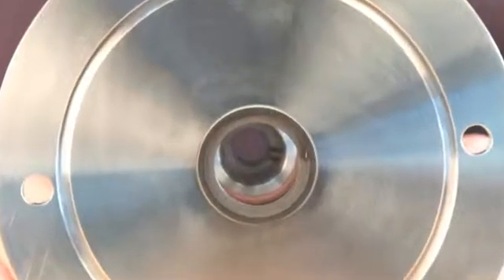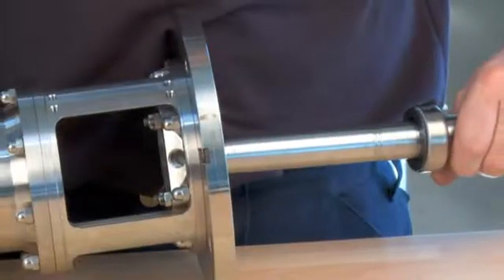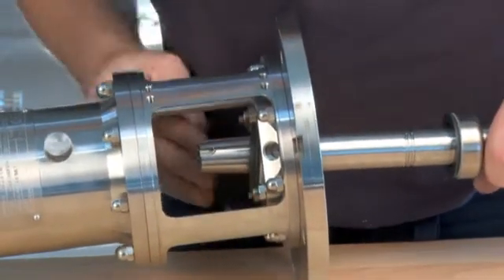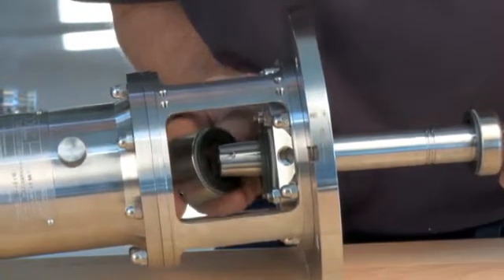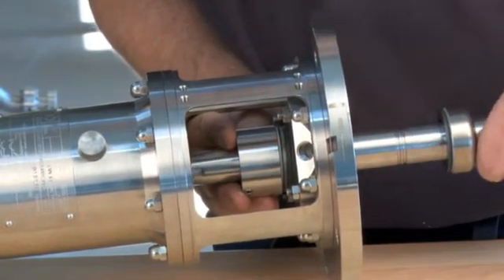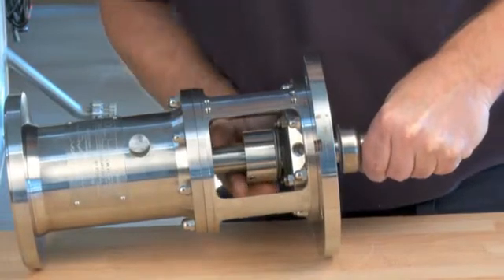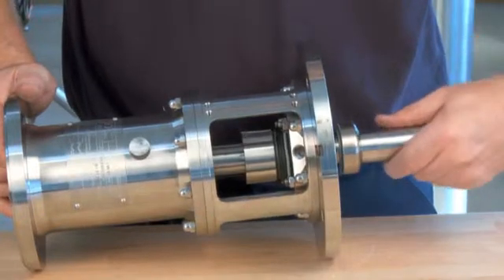Gently place the shaft into the bearing frame. Be aware that the pin on the bearing frame has to fit with the keyway on the shaft. Gently place the stationary part of the seal onto the shaft. Gently place the seal housing onto the shaft. Continue to position the shaft in the bearing frame. Turn the shaft until the pin in the bearing frame and the keyway on the shaft fit together.